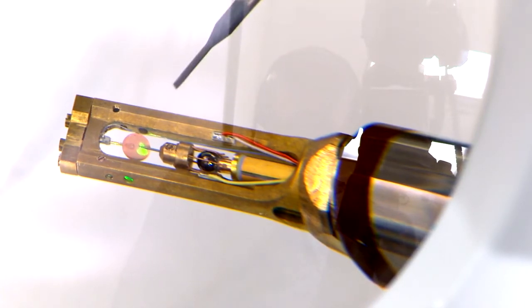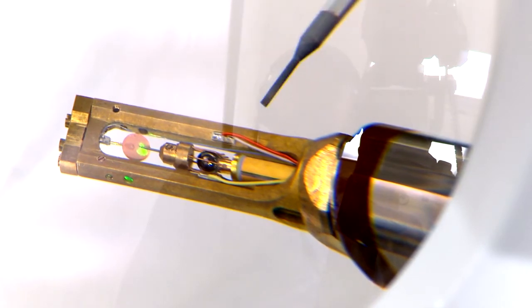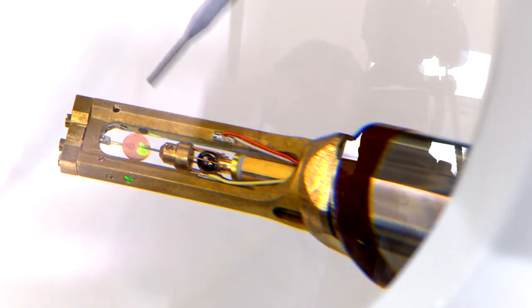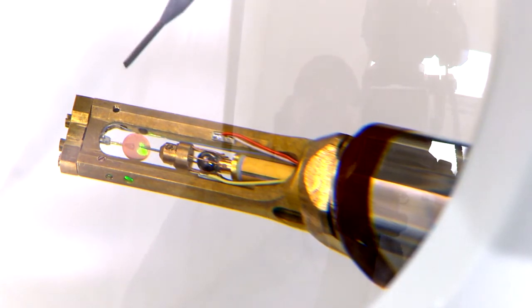Which is controlled by piezoelectric transducers further up the column here. Also visible here are sample leads, white and red here, that go down to smaller wires that lead to the sample on the TEM grid. And there is also another mirror on the opposite side here that can collect light from the sample and direct it back up the column for further analysis.